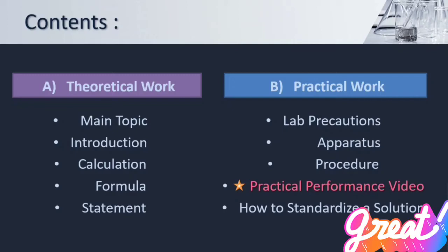Moving towards the content, it is basically divided into two parts. Number one is the theoretical work and number two is the practical work. In the theoretical work, things to be explained are the main topic, intro, calculation, formula and statement. In the second part, we are going to discuss the lab precautions, apparatus, procedure and the most important and awaited thing, the practical performance video. And lastly, we are going to discuss how to standardize a solution.